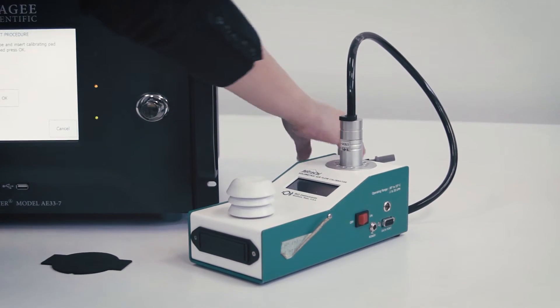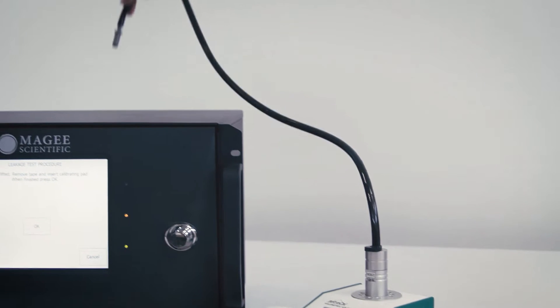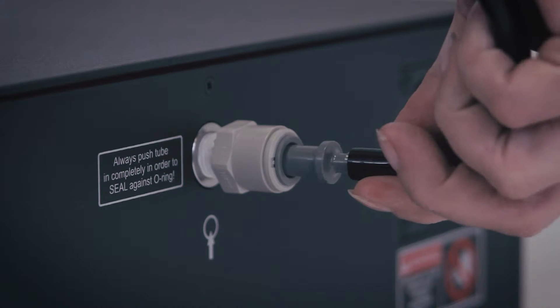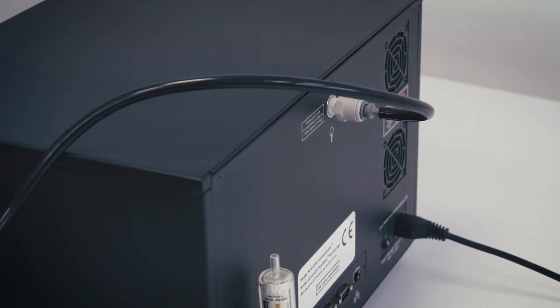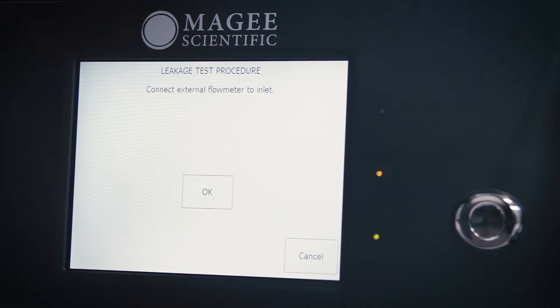Connect your external mass flow meter to the inlet port. Connect the flow meter using well-sealed tubing and fittings. Make sure that the hose connection is tight. Press OK.